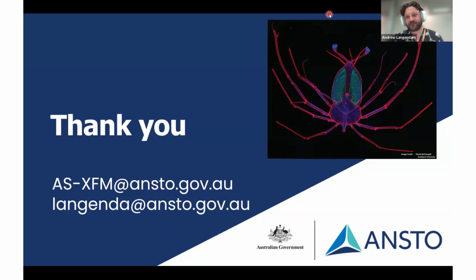Thank you, Andrew. I have a question. When you mentioned that it's possible to separate the elastic signal in the Maia, is that also possible using the DMM? It was just an example, or it's possible in both? Okay. Yeah, we can do it with both.